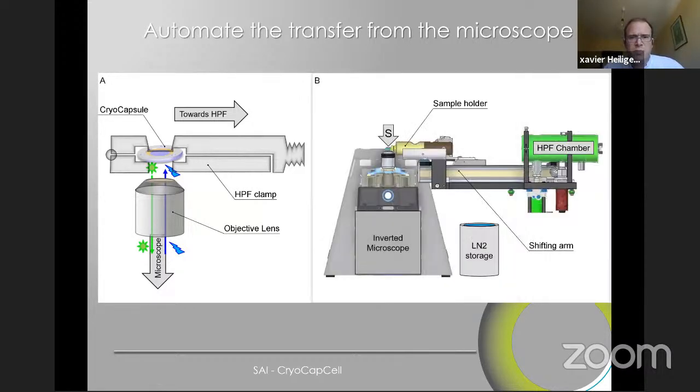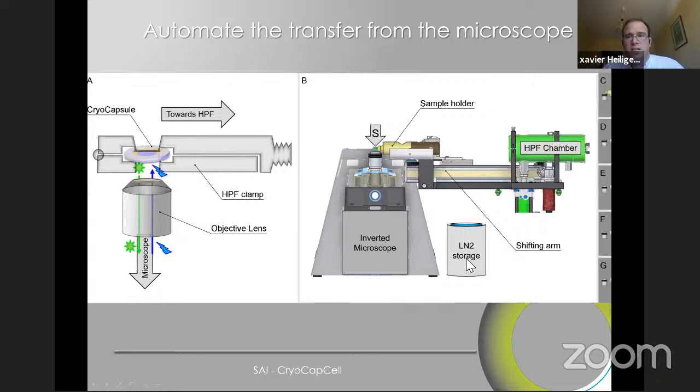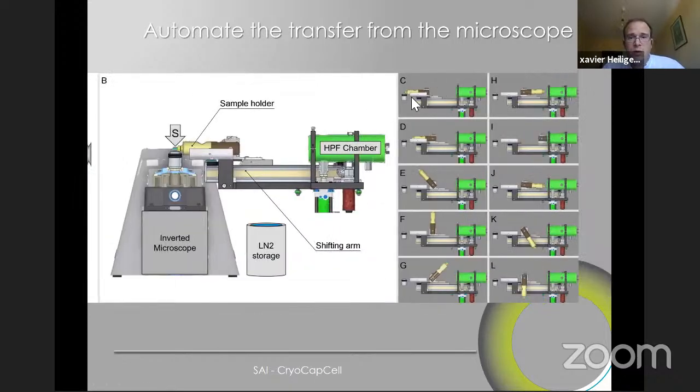So what we want is then to be able to have the sample holder standing just right above the microscope lens, and then at a given time, transfer the sample into the HPF chamber before storing it into liquid nitrogen. So technically what you would see is the sample is observed, and then you just say, okay, I want to freeze it now. You click a button, the sample is retracted, rotates progressively, enters the HPF chamber, and then HPF is done. Once this is done, we release the sample and we store it into liquid nitrogen.